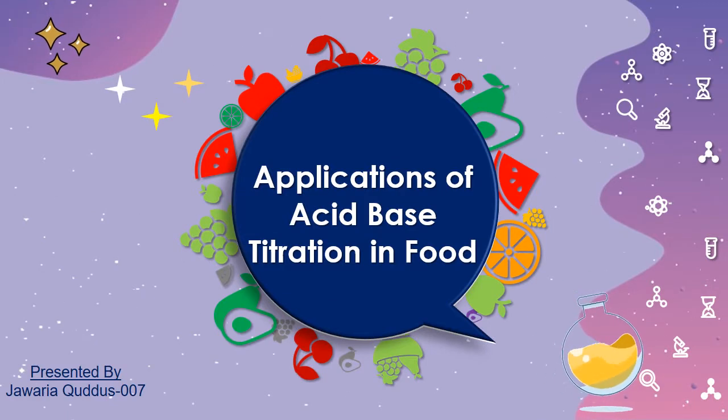Today we will see the applications of all the four types of titration in food sector. So let's start with applications of acid base titration.